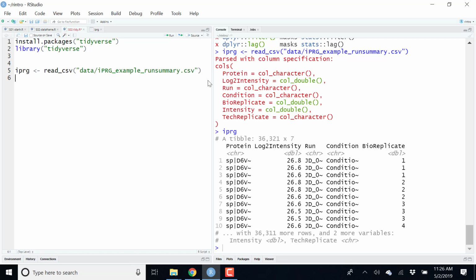Yes? Wouldn't you be calling, naming those tags vectors? No, these are characters. CHR stands for characters. But that's a very good observation. Read_CSV does not do this conversion like read.csv does. Now, having said that, you could have used read.csv for all the rest of the manipulations that we are going to do.